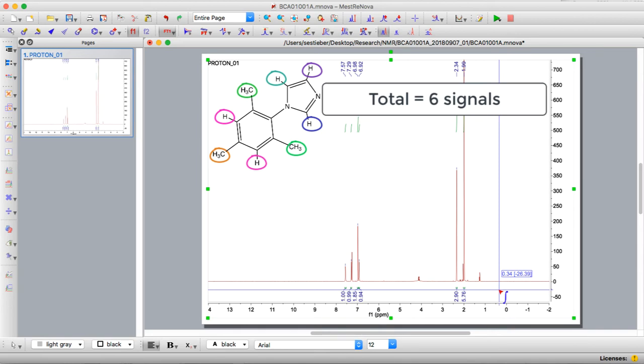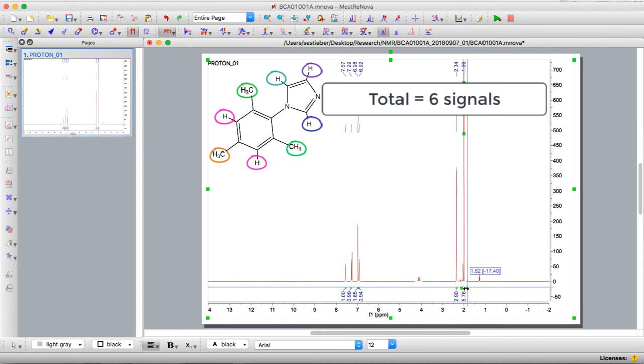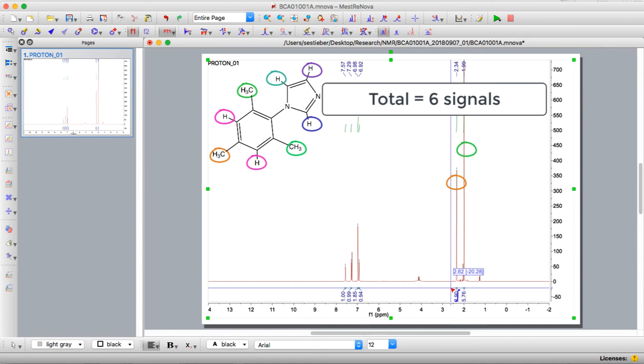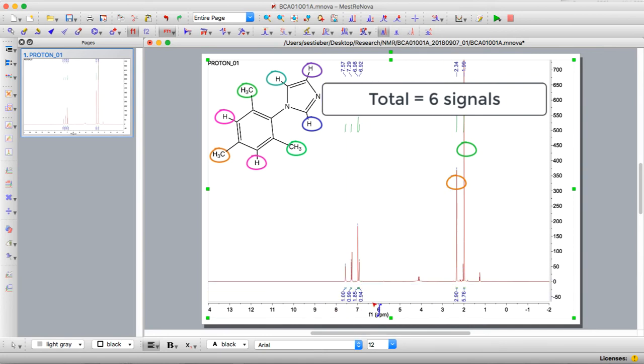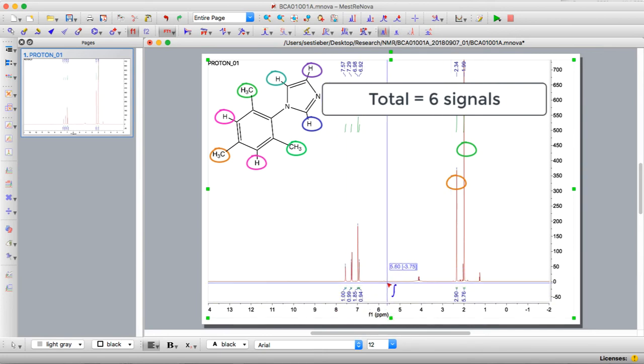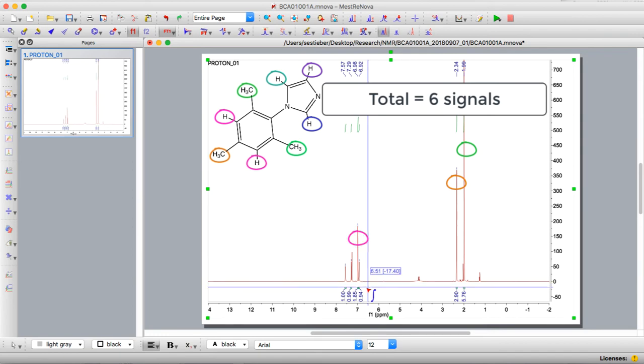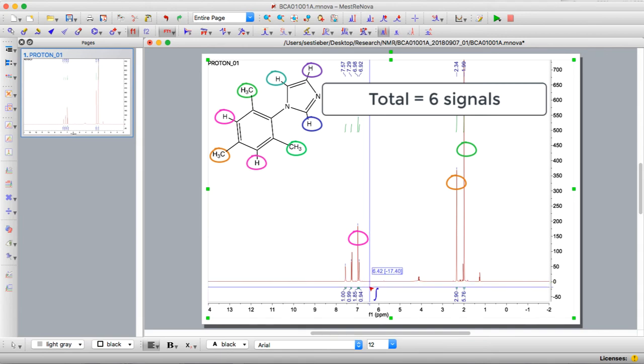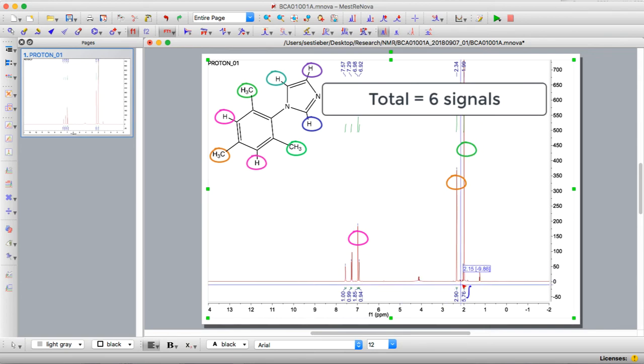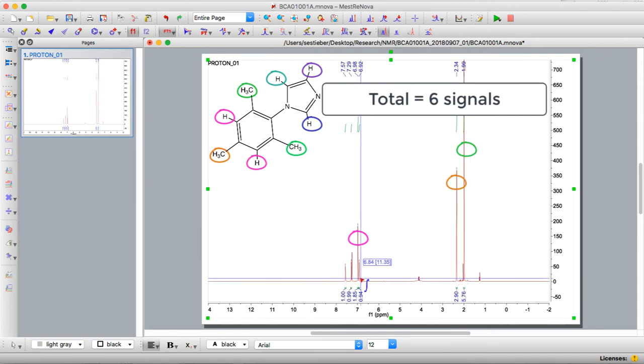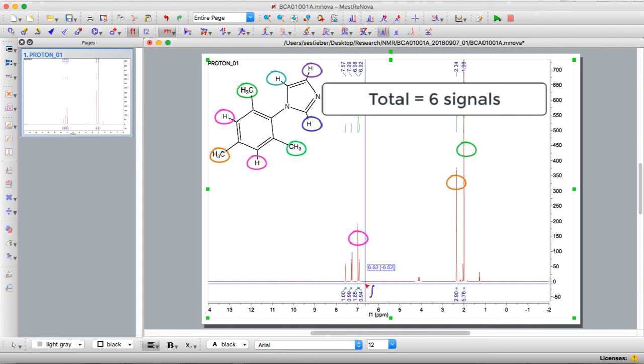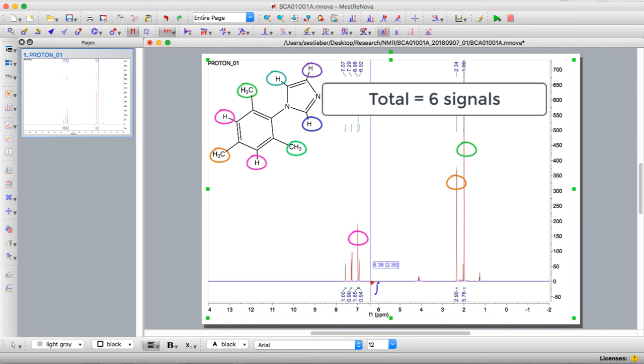Now just based on the ratios we can figure out which is which. This one with integration of six is our ortho methyl group. Integration of three is our para methyl group. These ones we have more difficulty. The one that integrates to be two is our meta aryl group. The other three all have integrations of one so they're much trickier to distinguish. The other thing to notice on the spectrum is methyl groups typically show up around two so that's in good agreement. And aryl groups or groups attached to more electronegative atoms are usually around seven.